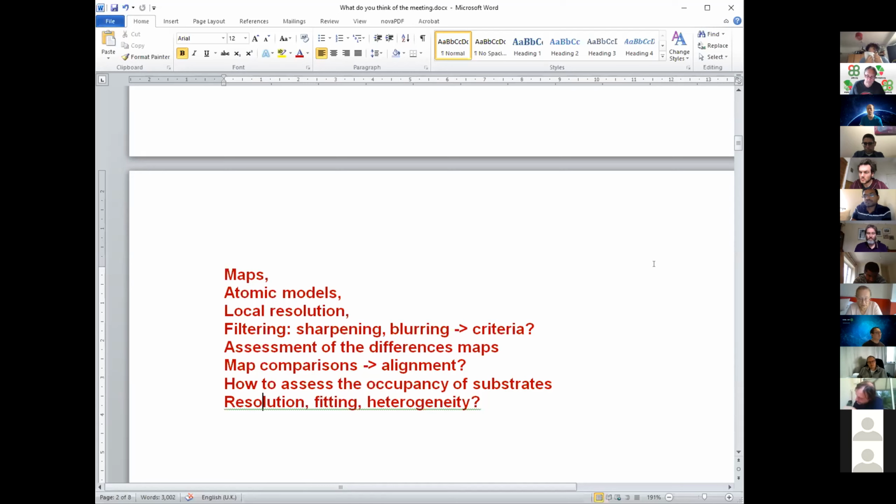And I hope everybody has heard about the three papers at nearly, really, atomic resolution. One was yours. It was Holger Stark, and eventually one by Sriram Subramaniam, when they got very high resolution and were able to see quite a lot of details and structures. So the race for high resolution is continuous and it will go on.